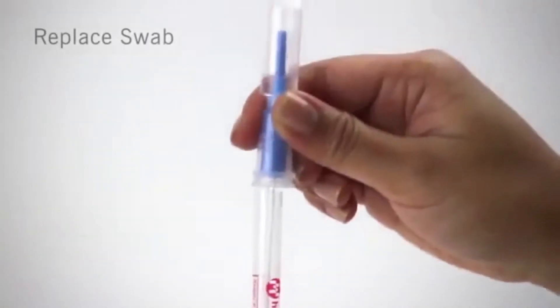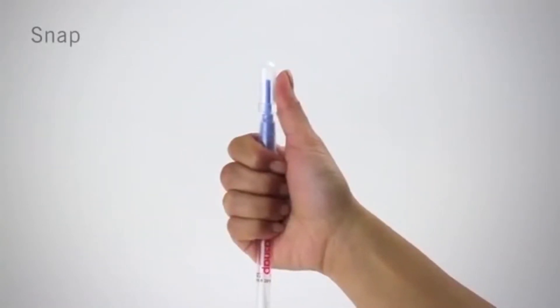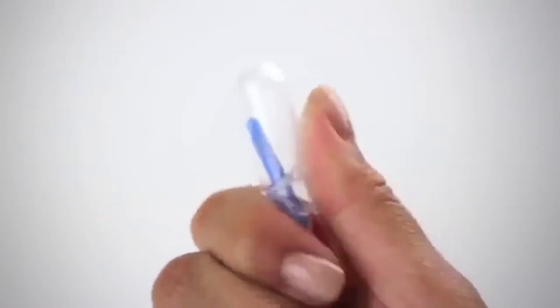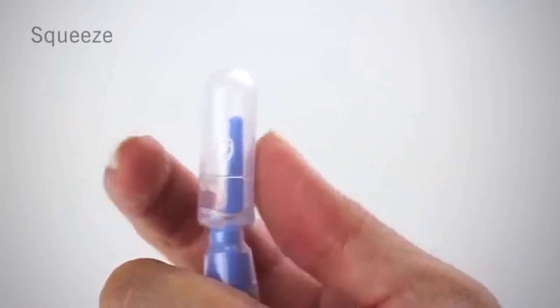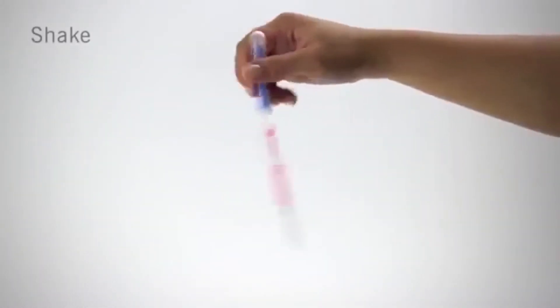Replace the swab in the tube. The easiest way to activate UltraSnap is to hold the device in your fist and use the thumb and forefinger to break the snap valve by bending the bulb forward and backward. Next, squeeze the bulb twice to expel liquid into the tube. Then shake for 5 seconds.